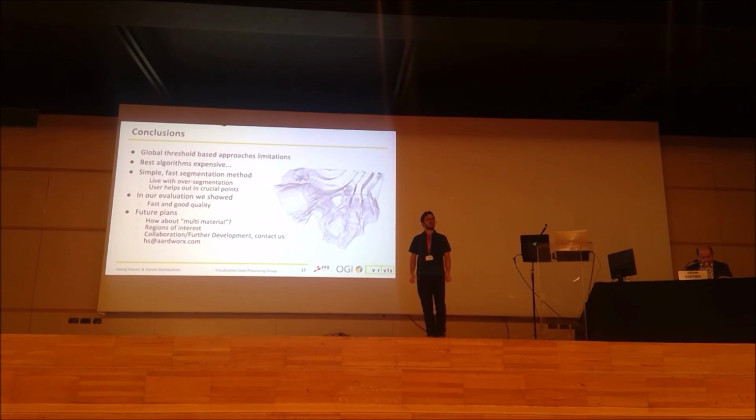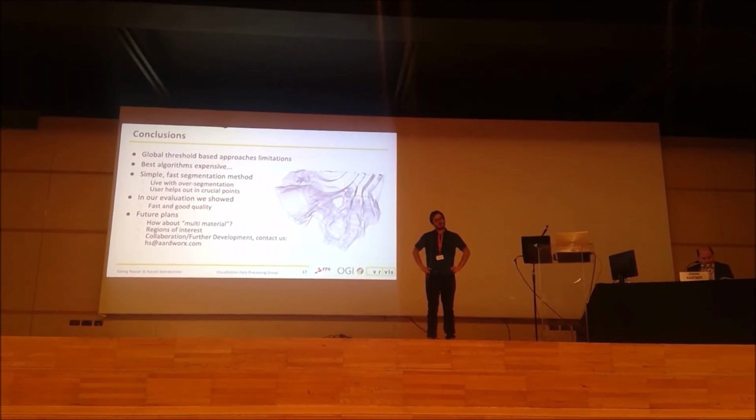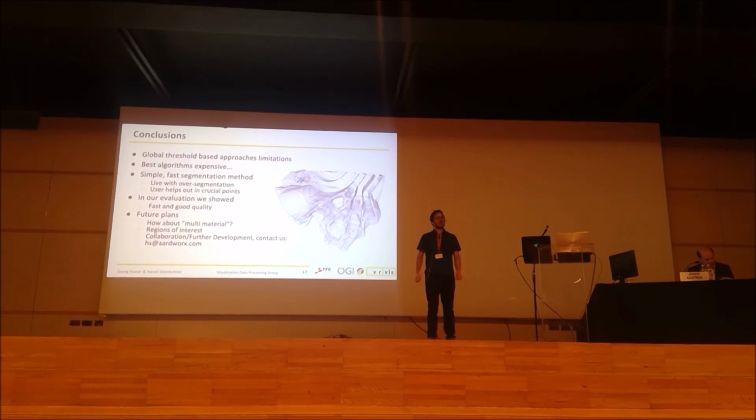What would then be the limit of pore detection in terms of voxel size, like 2 voxels in diameter, or 8 voxels? Do you see any limitation? Technically, it's just a sampling question: how small pores you can count as pores.